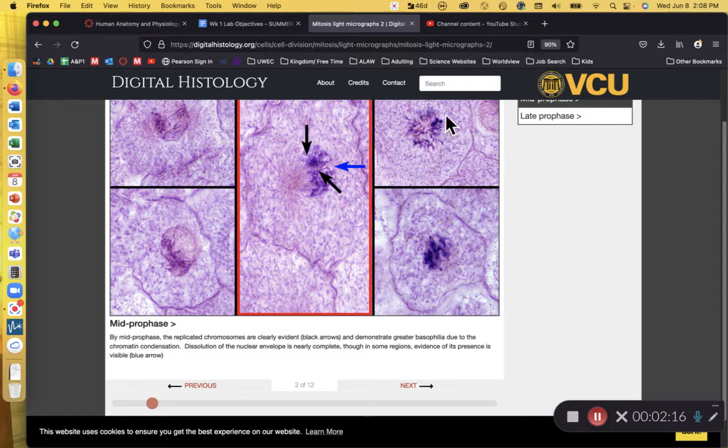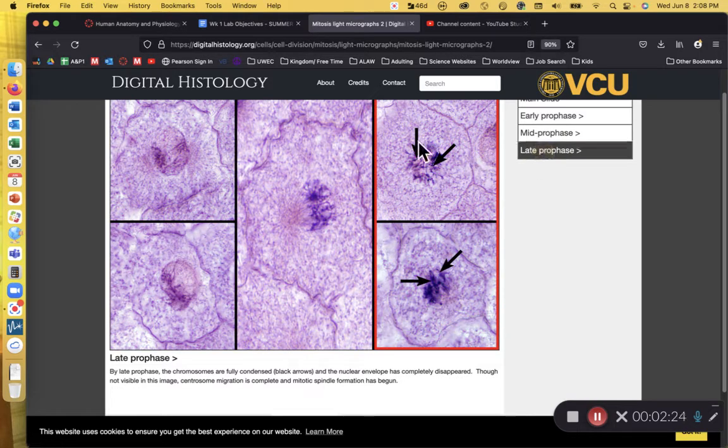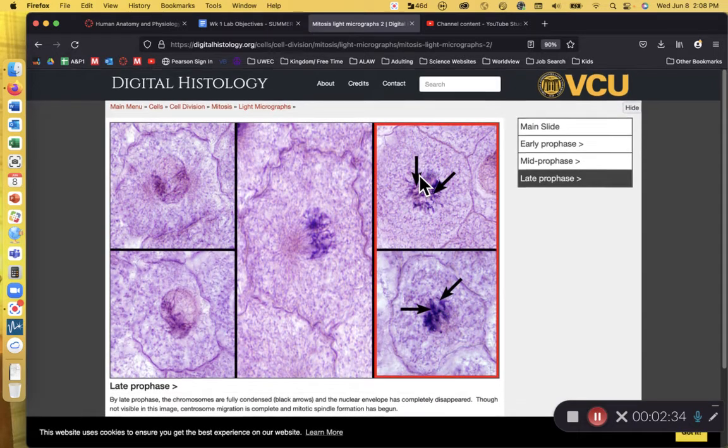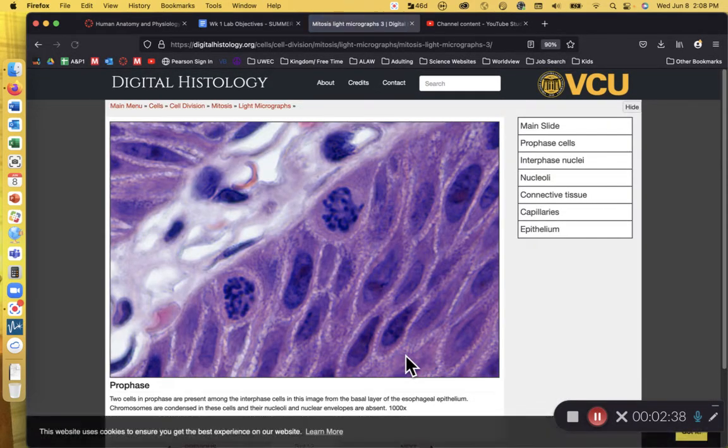So it looks heterogeneous; instead of being homogeneous, it's heterogeneous. That heterogeneous appearance of the nucleus is the chromosomes condensing out of the chromatin. So if you see purple speckles where the nucleus is, there's your sign. We're looking at prophase. Then after prophase, we're going to have metaphase.